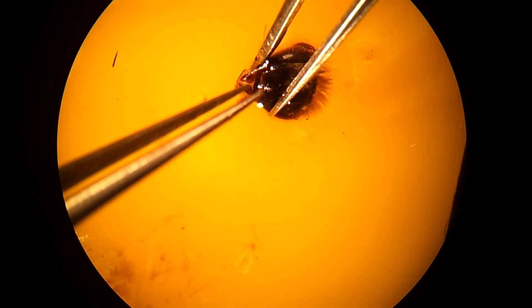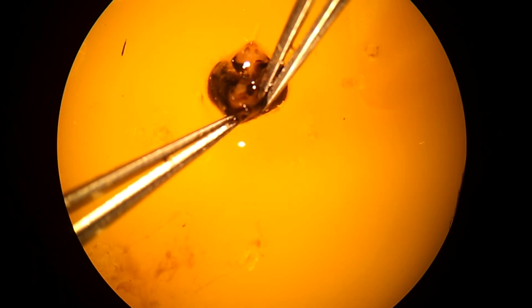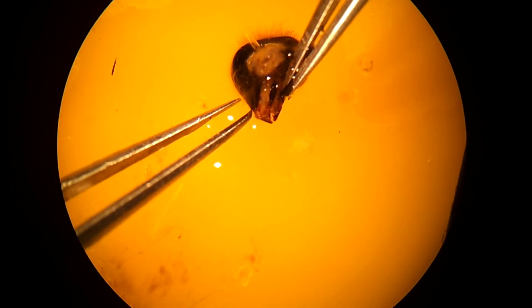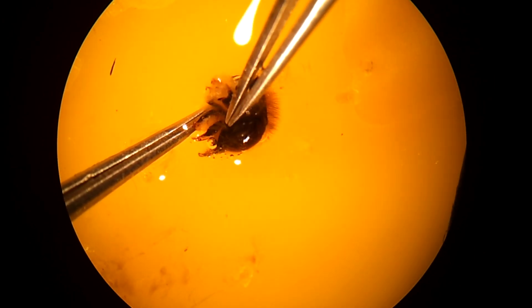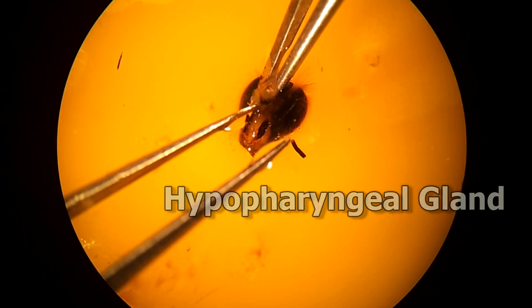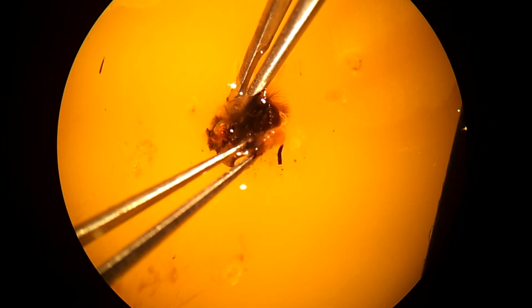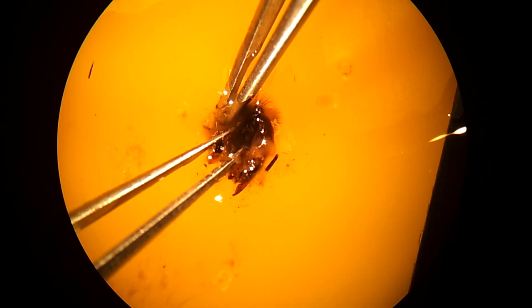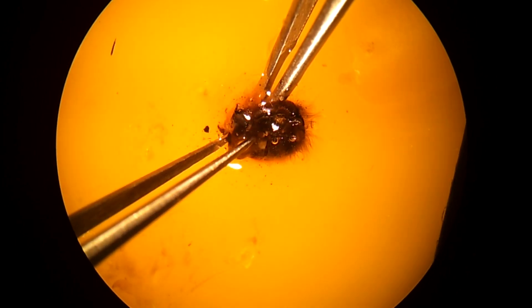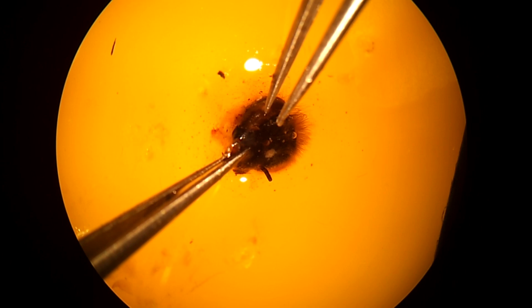Opening the head proved to be very challenging. We were instructed to take off the cuticle — easier said than done. It's a little like trying to peel an uncooked egg, a very small egg, with tweezers under a microscope. The reason we opened the head was to locate the hypopharyngeal gland. This is the gland that produces the primary ingredient in royal jelly. When doing nutritional analysis, this gland is removed and tested for its protein content. This is actually my second attempt at dissecting the head. I found it easier to do this underwater — most of the debris floats off and you can see what you're doing much better.